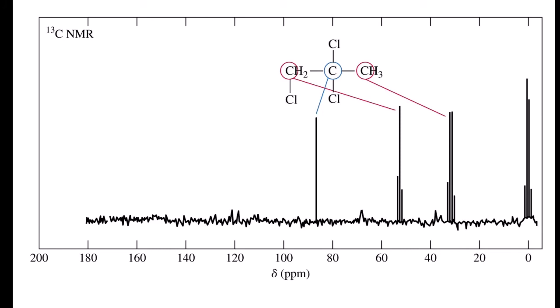So in simpler terms, each signal corresponds to an atom and you will know its electronic environment. So from this, you will get the picture of what atoms are bonded to it or what atoms are nearby. So for example, in the NMR spectrum shown, the peaks are attributed to different carbons in this compound.